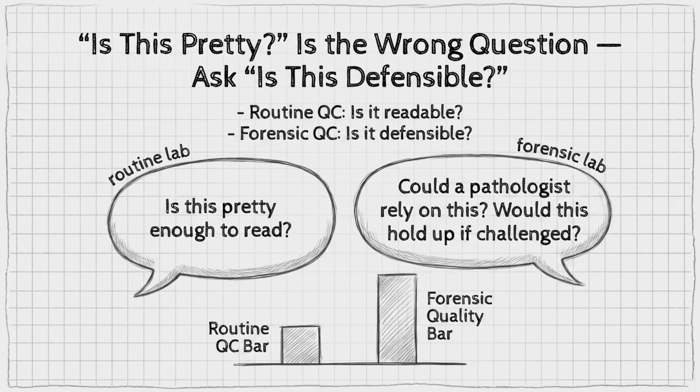Every technical decision you make, from embedding orientation to coverslipping, needs to be made with this question in mind. Because in forensic work, a pretty slide that isn't defensible is a useless slide. This leads us to a fundamental shift in perspective.